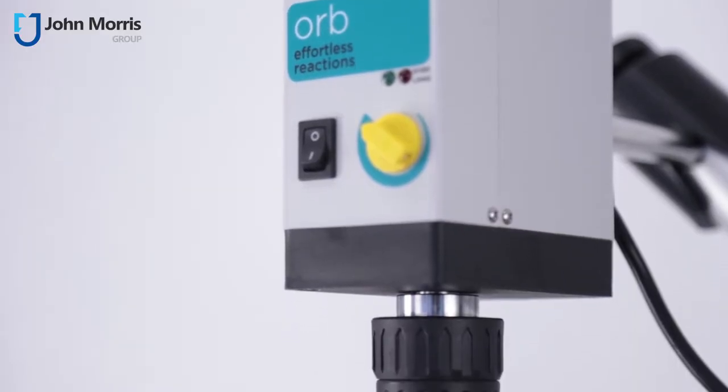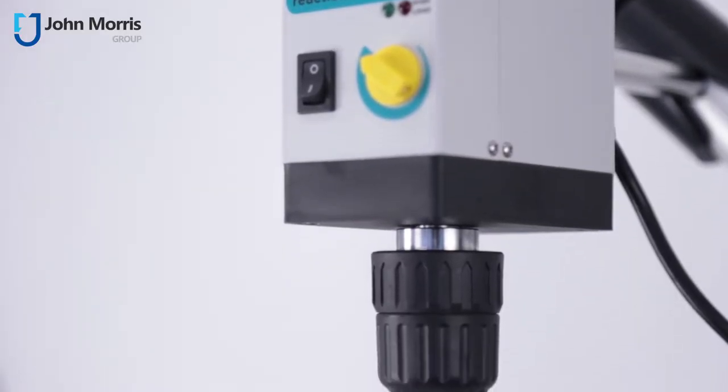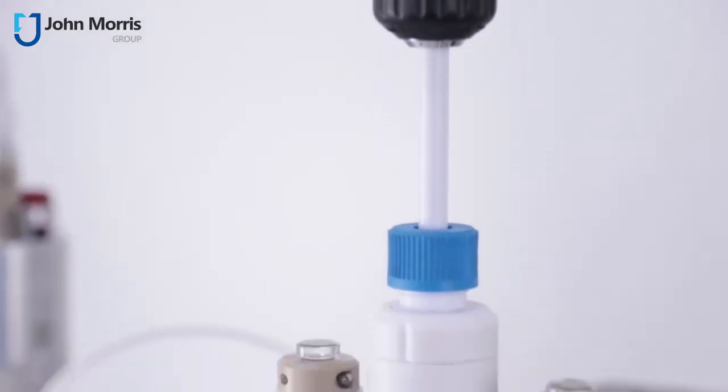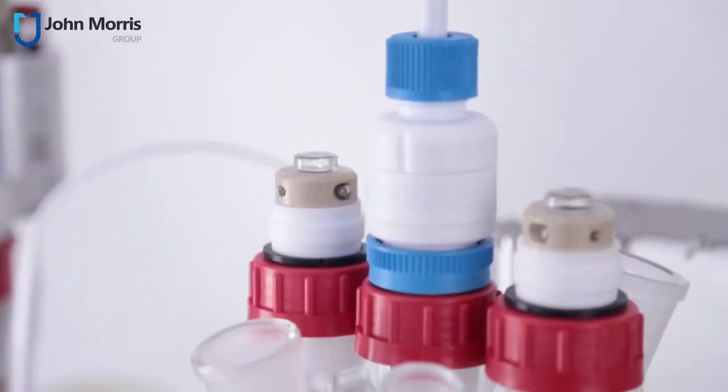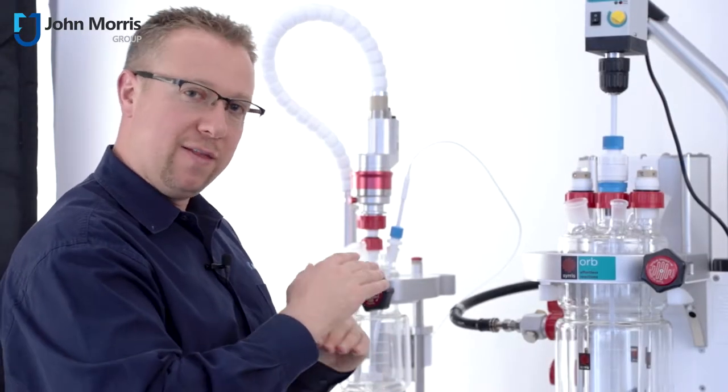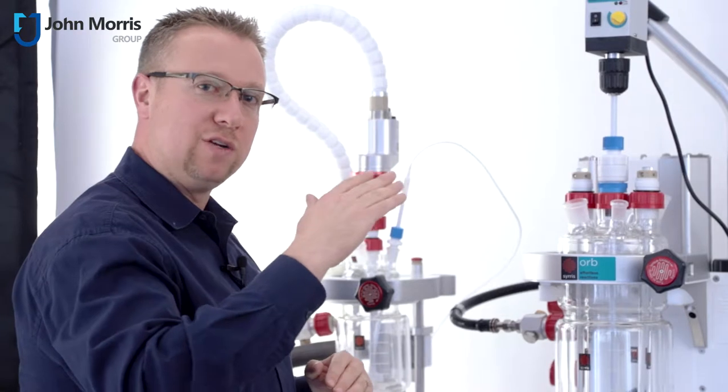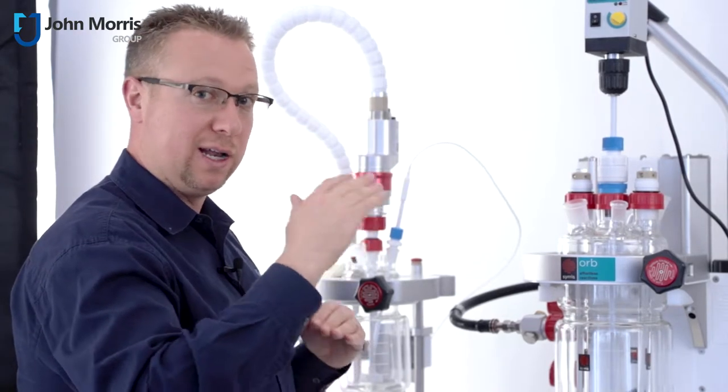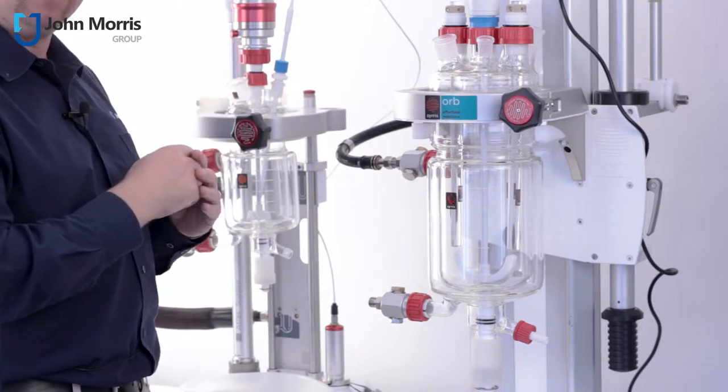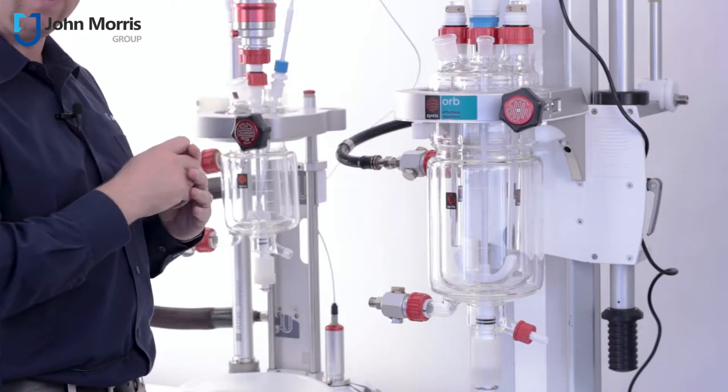Not only does the Orb allow you to do just about everything you need to do without the requirement for any tools, you can make all of the changes with your hands, but it also has one dramatic advantage over the Atlas HD and that is it enables you to go to a much larger volume range right up to 10 liters. Let's have a closer look at the Orb now so that I can show you some of its unique features and benefits over other brands on the market.